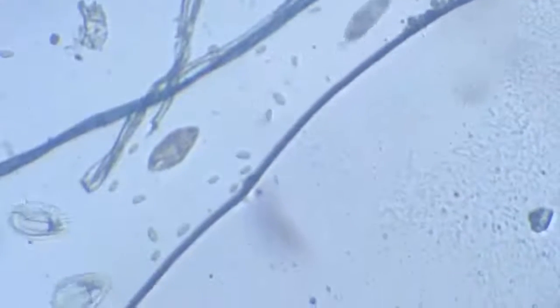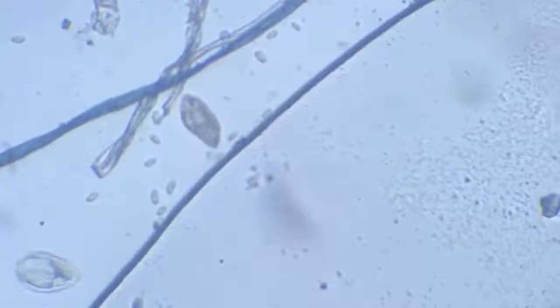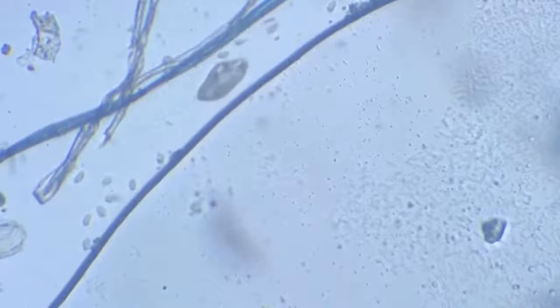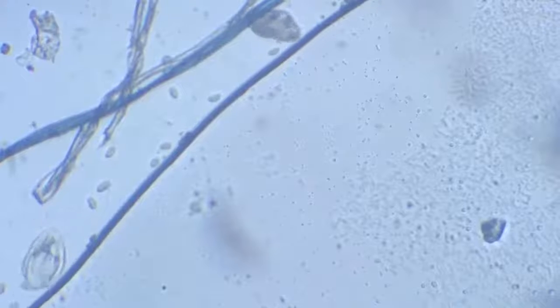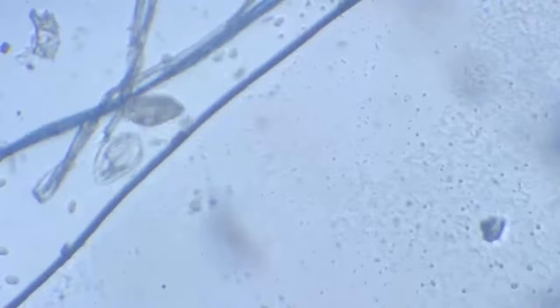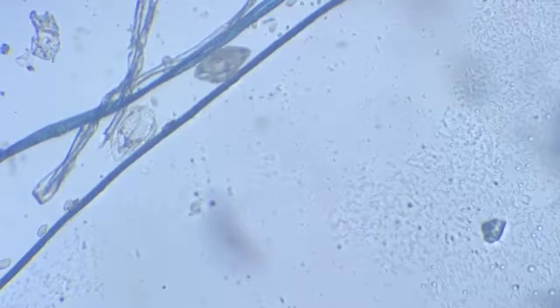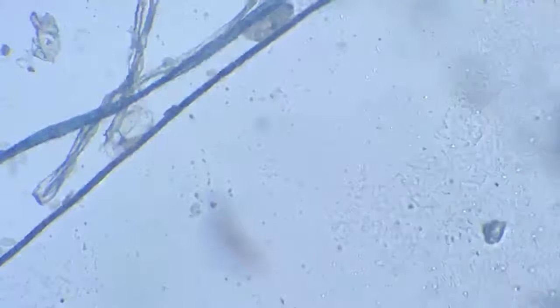Again, we have some euplotes, some euglenids, and some paramecia. And we have a lawn of bacteria at the right bottom corner. This water film is closing in.